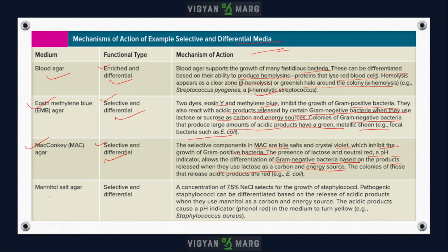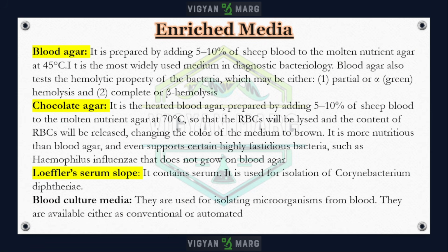Okay, and another is mannitol salt agar, which is a selective and differential media. Okay, you can read it out. Another is, we will focus specifically on enriched media. Okay, and the first example is blood agar.